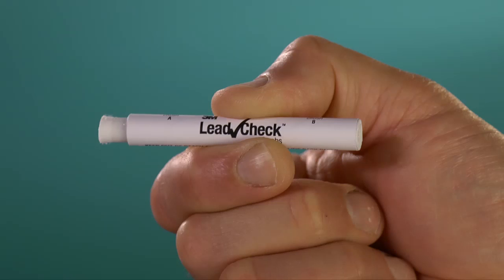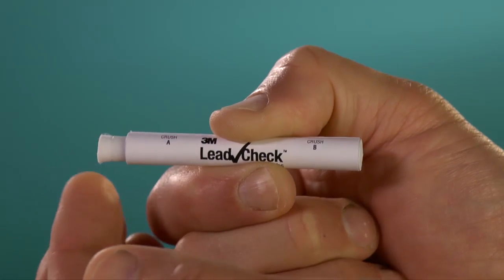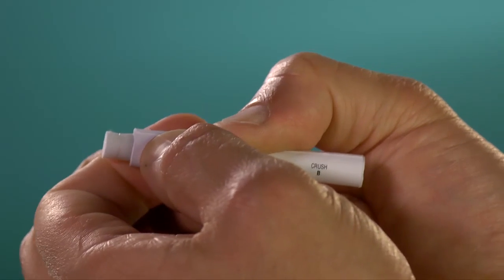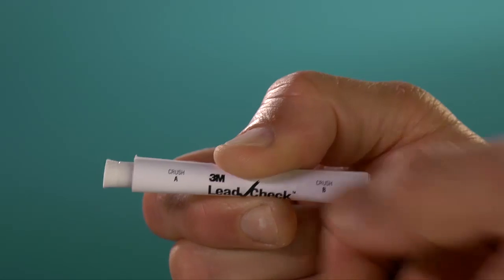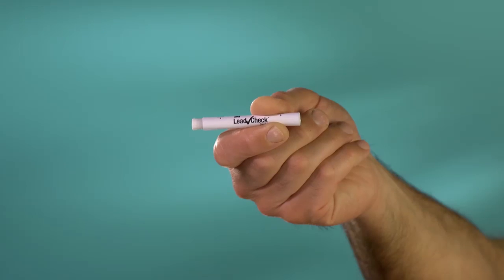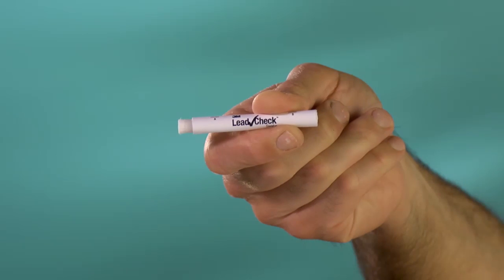Now, activate the 3M LeadCheck swab by firmly squeezing each end at the points marked A and B on the cardboard cover until you can feel and hear the ampules inside being crushed. Shake the tube vigorously for a few moments to be sure that the chemicals inside have mixed. The 3M LeadCheck swab is now activated and ready for use.